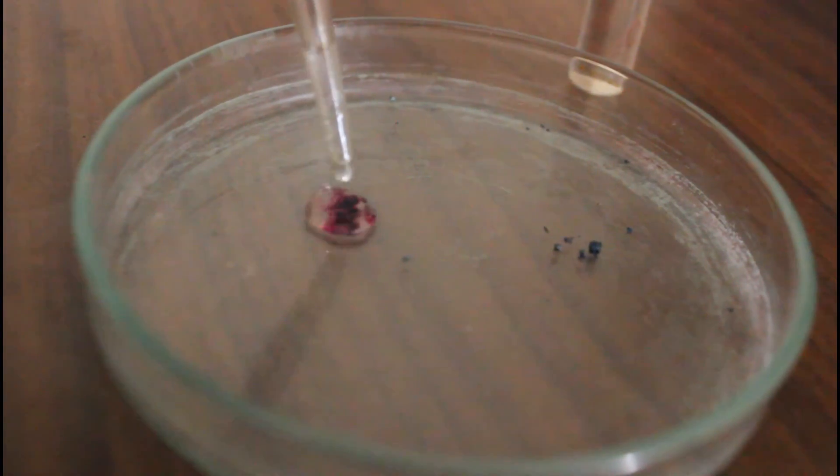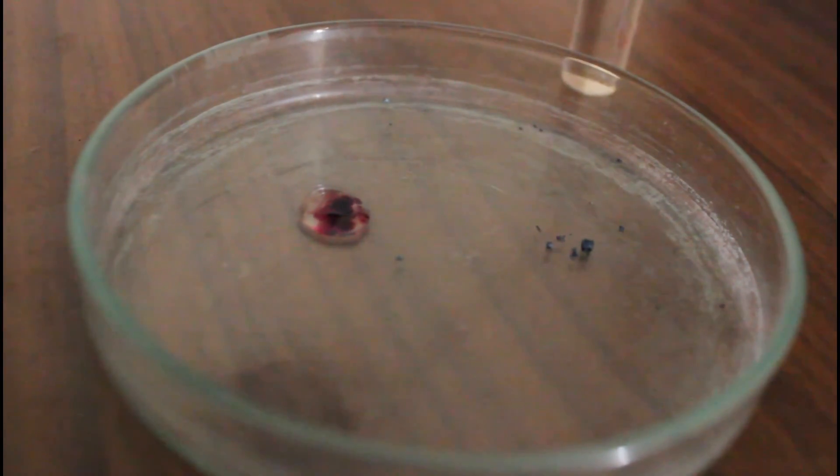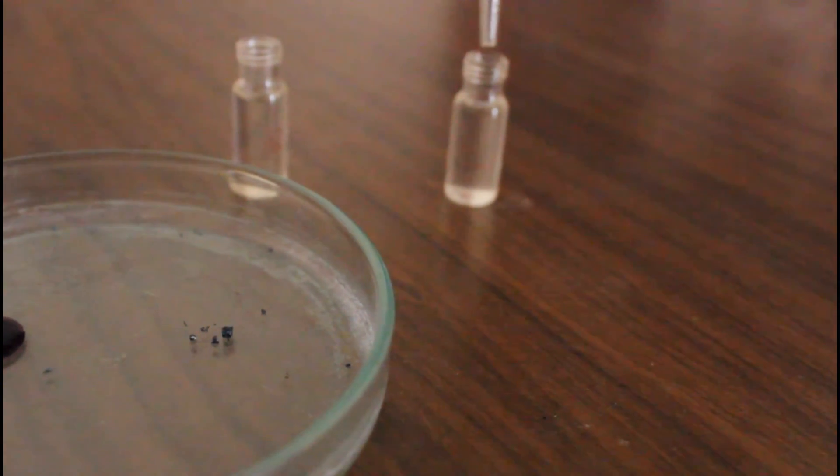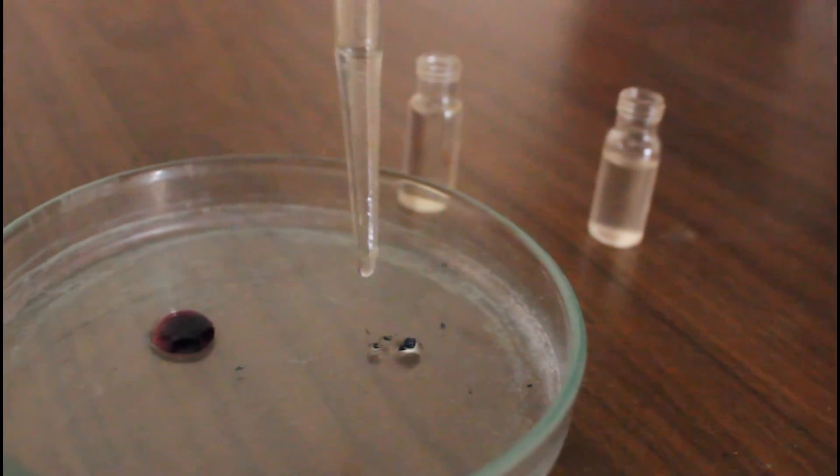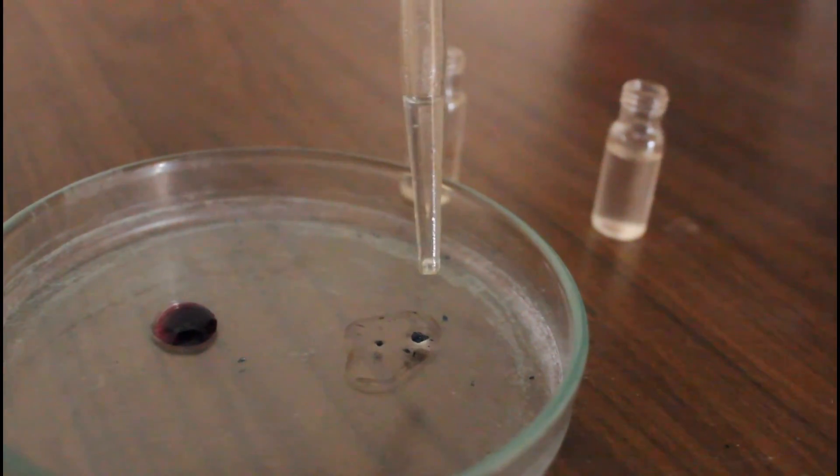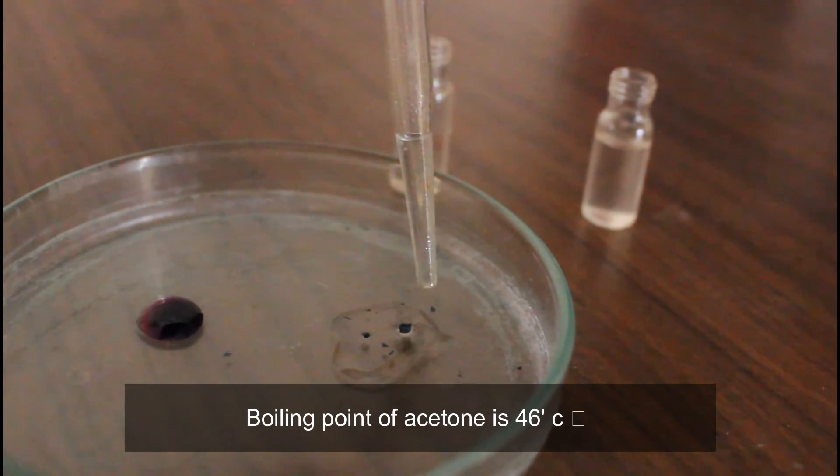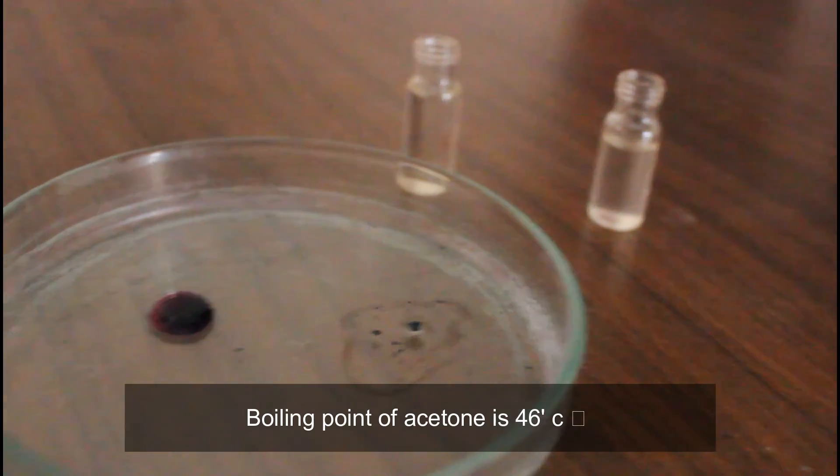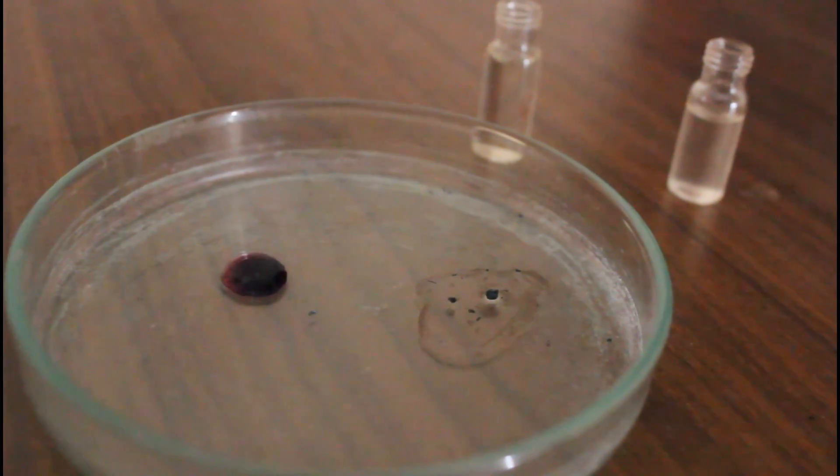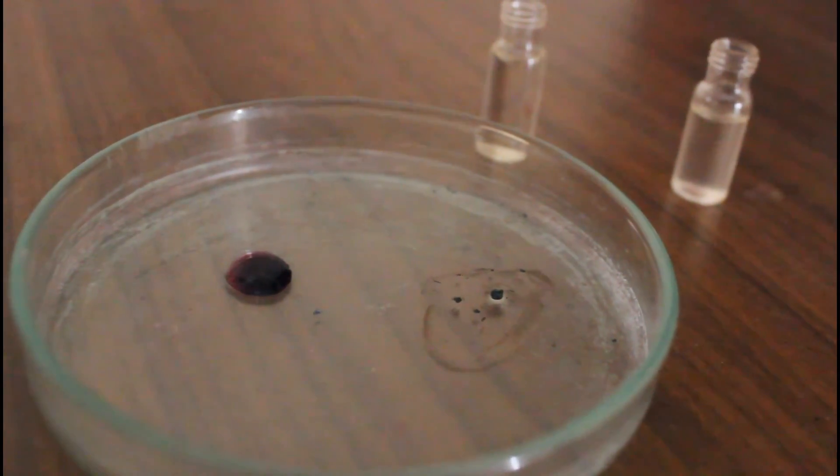As you can see here the sample L dissolves the potassium permanganate while the sample U is oily, hence it doesn't give any solubility. L is acetone while U is still mysterious.